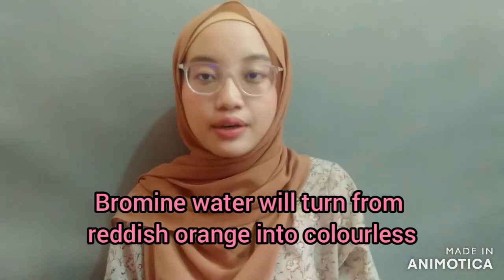So bromine water has a yellowish, orange, reddish color. When we add a few drops of bromine water to the unknown solution that might have alkenes, it will turn the reddish, yellowish, orangish color into colorless. So this is what we call decolorizing.